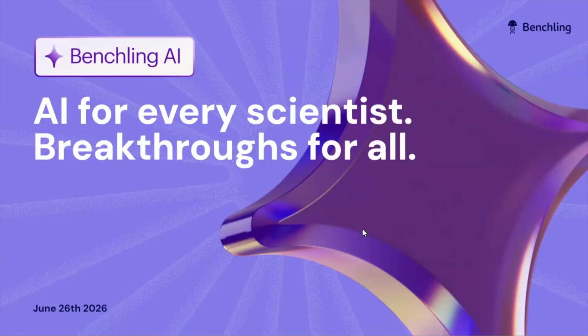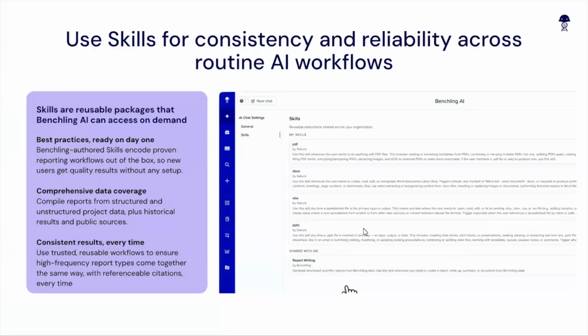Today, I wanted to cover our newest Benchling AI skill, where to find it, what it's used for, and how it can help you. But first, let's just do a quick refresher on skills. Skills are reusable packages that help bring consistency to any kind of data and report generation that you're going to use through AI and Benchling.